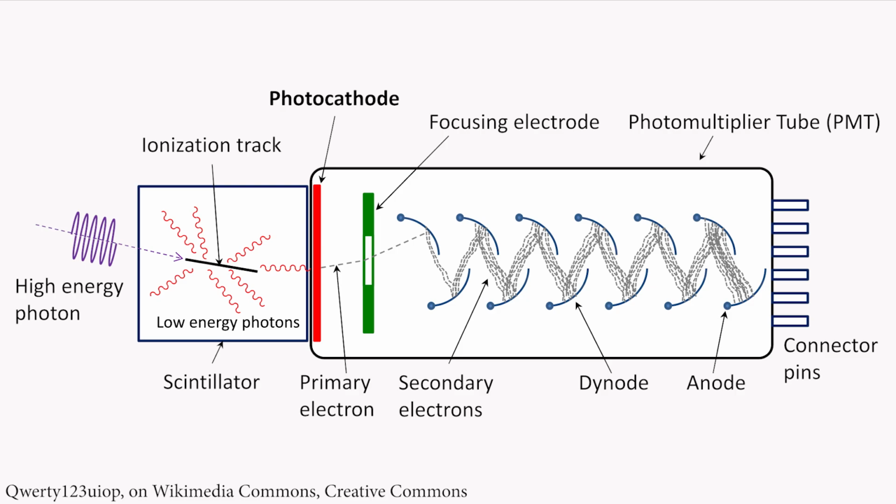So basically in the photomultiplier tube, we take the photon, convert it to a lower energy photon and then an electron, and then we just put it through an electron multiplier, and we get a signal with good gain, or good amplification. So photomultiplier tubes are pretty sensitive. They're really good detectors for these double beam instruments, but we're going to talk about a different configuration of detector now that's honestly not as good as a photomultiplier tube in terms of absolute quality, in terms of sensitivity and the performance that goes along with the double beam instrument, but it's much, much faster.